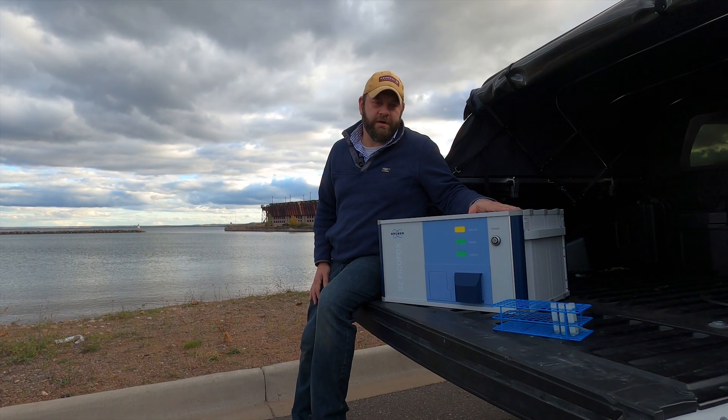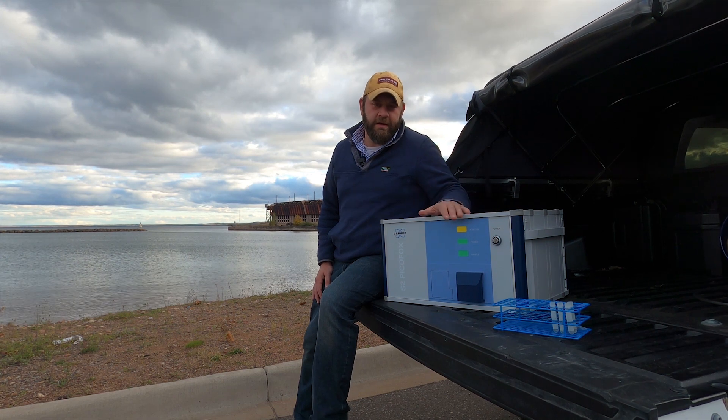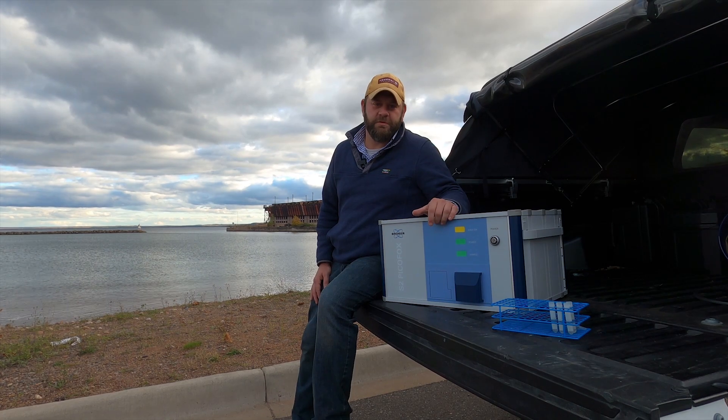Here we have Bruker's S2 PicoFox TXRF spectrometer. This instrument is for trace elemental analysis ranging from aluminum up to uranium.